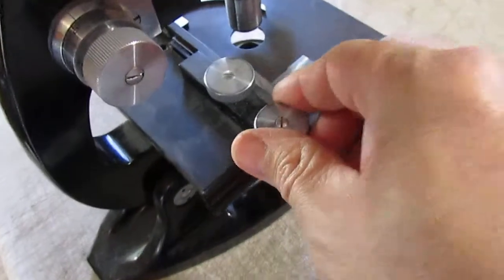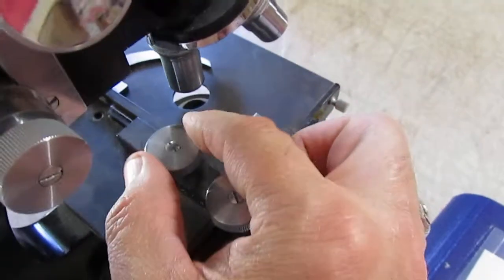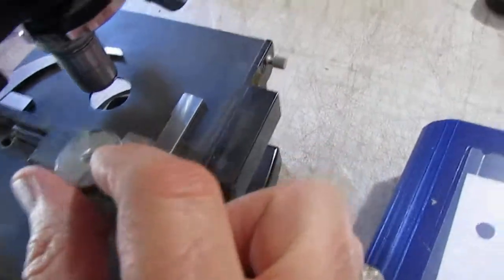So that'd be forward and backward. And then, oops if you can see that, and then left and right, right there.